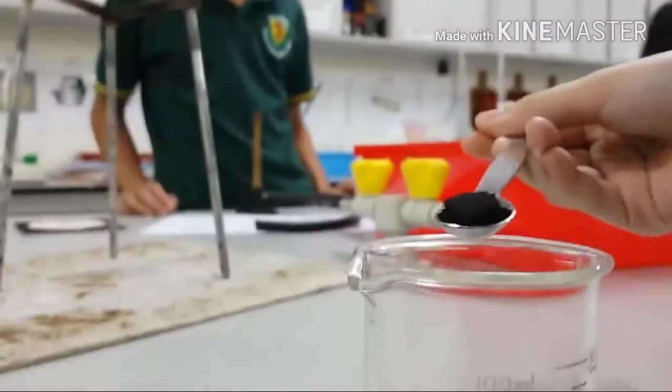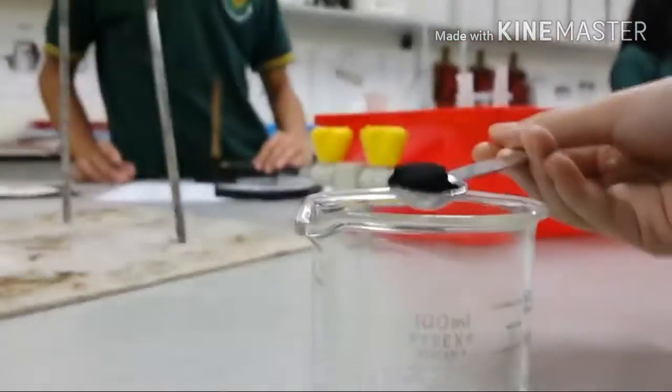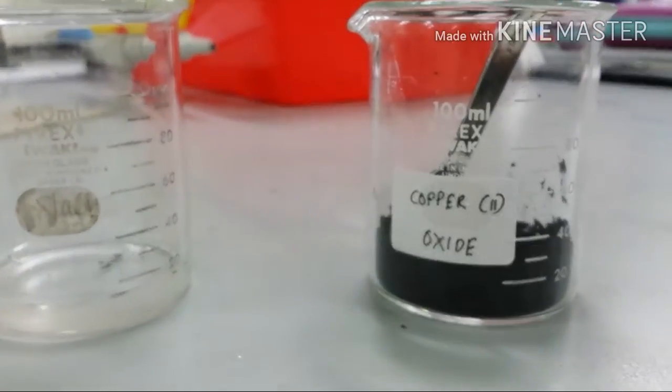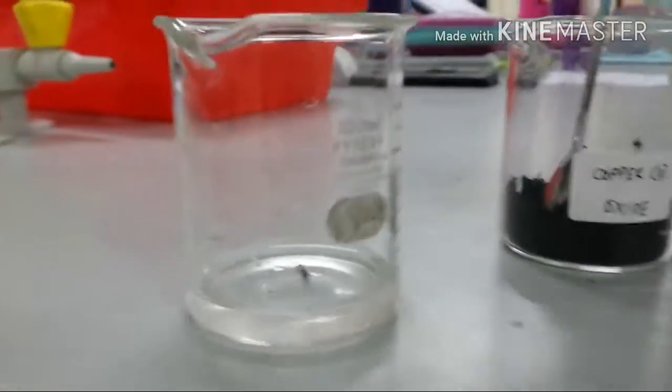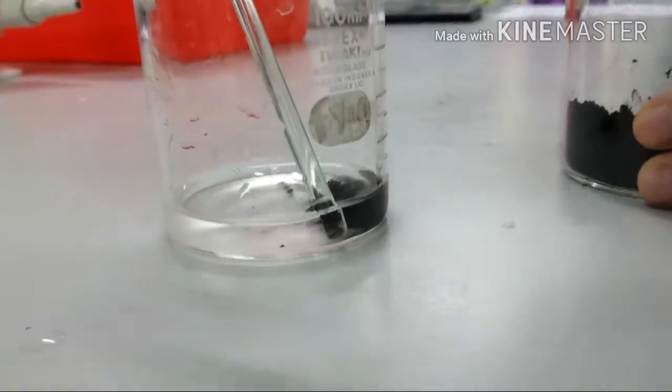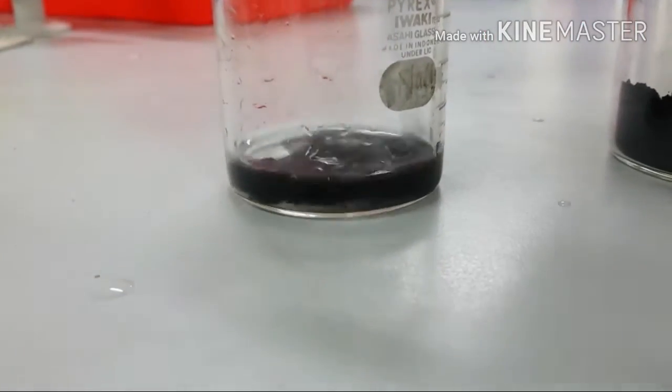And then put some... okay, put it in. And then put some copper oxide two in it. So yeah, we're gonna put some inside, just wait. There we go.